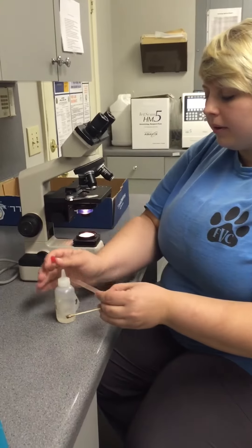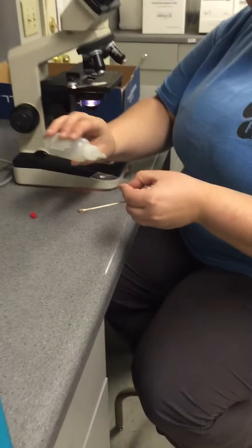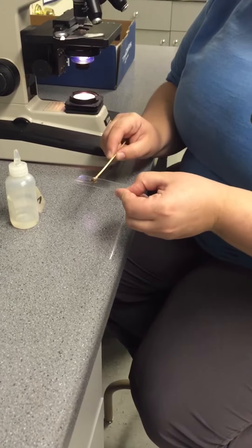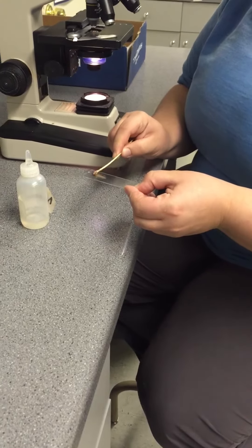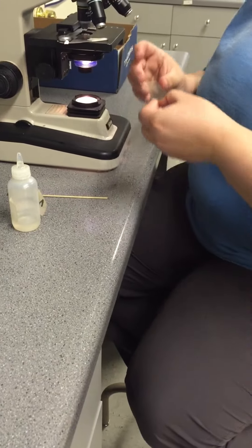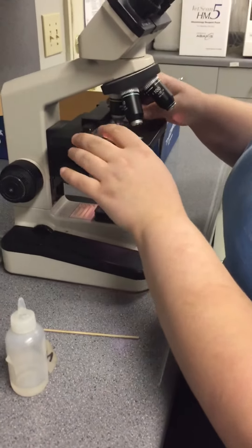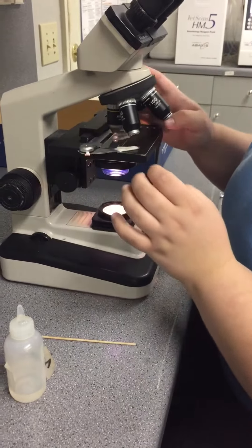I'm going to take a drop of mineral oil and just put it on the slide and I'm just going to roll the sample on there. And then we'll put it on the microscope.